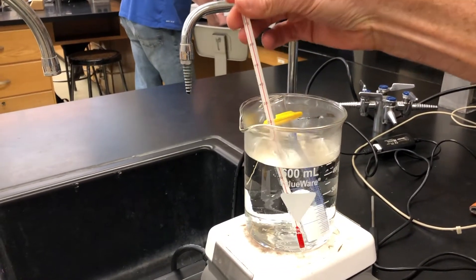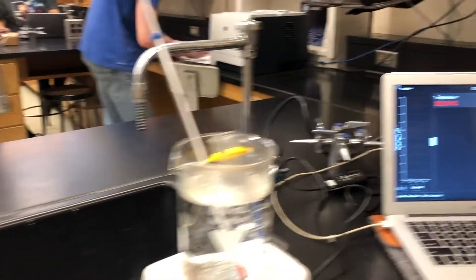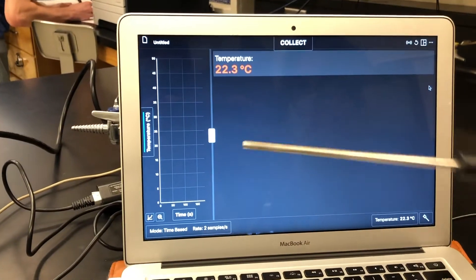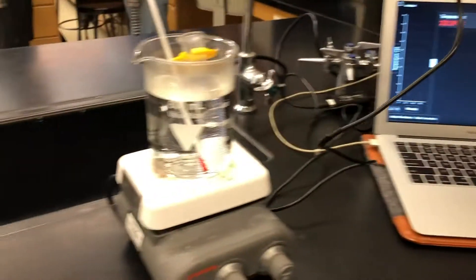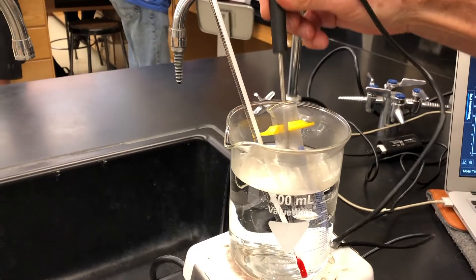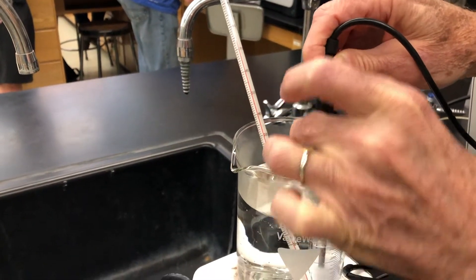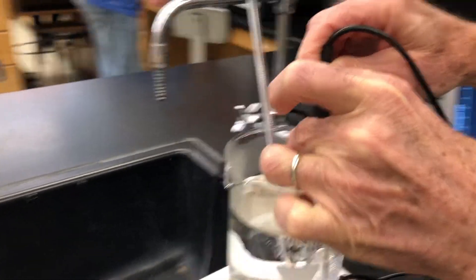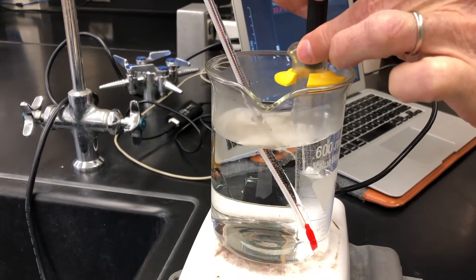Here's our hot water bath — we put in our KNO₃ with water and we're going to heat it up with stirring. We're going to use this temperature probe as both our temperature measuring system and our stirring rod. We're going to stir and heat until all the KNO₃ is fully dissolved.